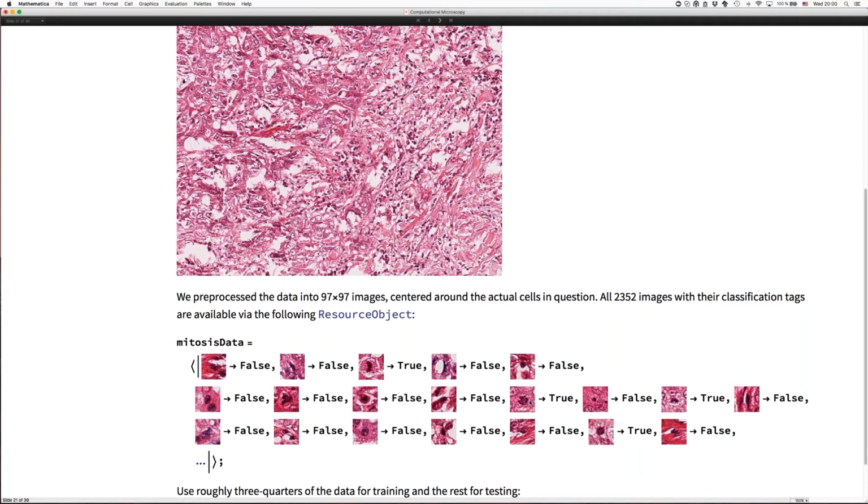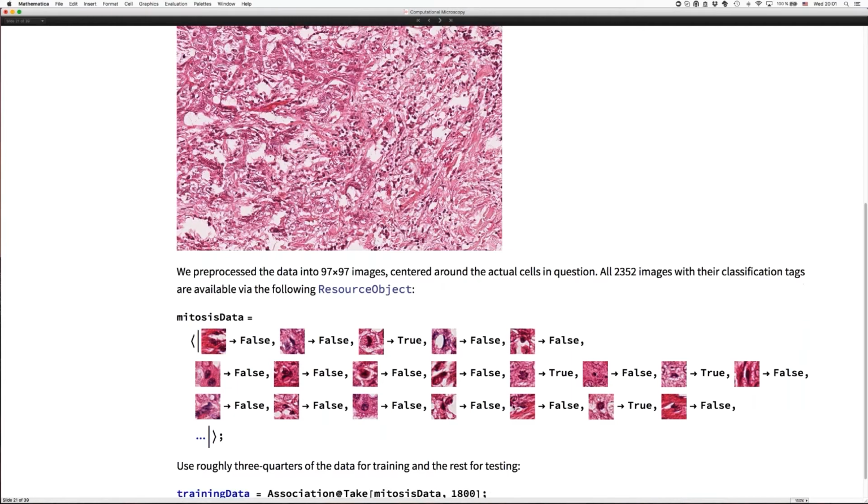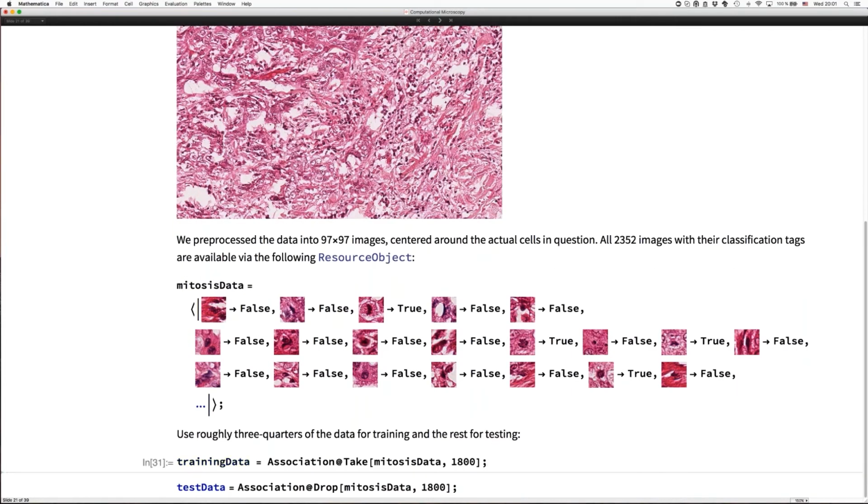This is not. Here again, I have mitosis. And even if you look at these images, at least personally, I have a very hard time telling at all what's mitosis and what's not. So this is definitely not a toy example. And what we have here now are 1,800 of these cropped images, with a mix of 50-50 or 1/3, 2/3 of cells undergoing mitosis and those that don't.